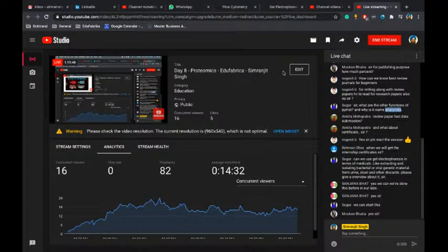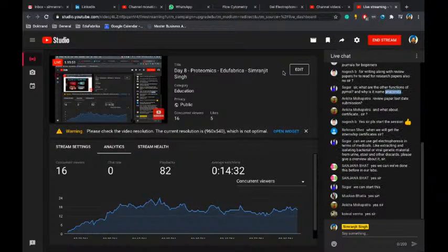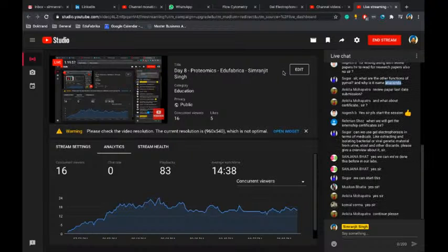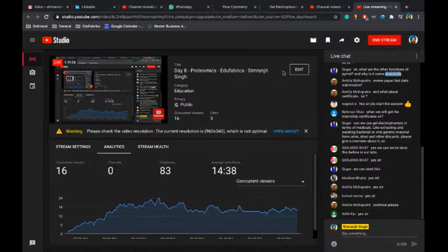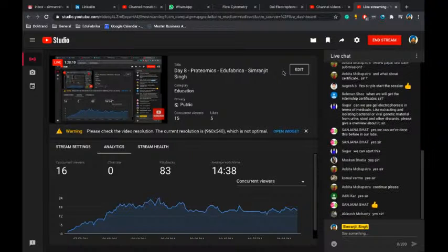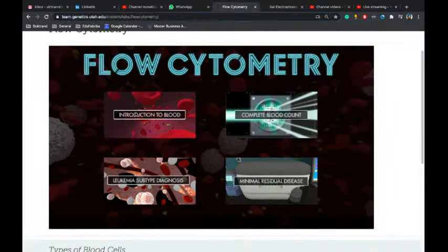Did you understand what has been explained today? With flow cytometry, with the forward and side scatter, with the fluorescence data, fluorescence 1 and fluorescence 2, how they are moving with the sheath fluid and everything. Okay, good. So give me some comments so that we know that things are going fine.